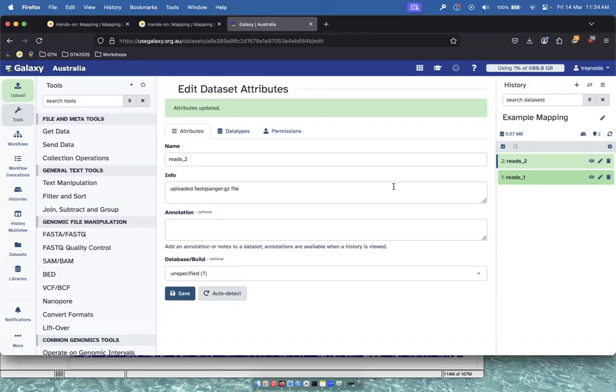Now, I'll stop here just to mention that during sequencing, errors are introduced, such as incorrect nucleotides being called, sequencing errors which might bias the analysis and lead to misinterpretations of the data. And the first step in any analysis you will be carrying out will be to check the reads' quality and perform any cleaning on your data.